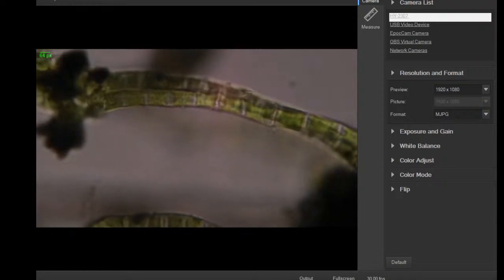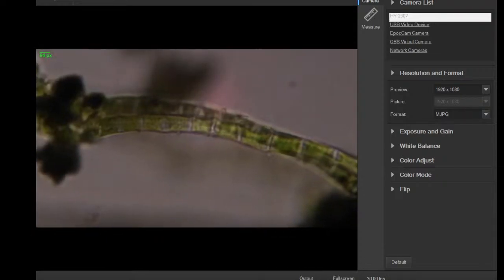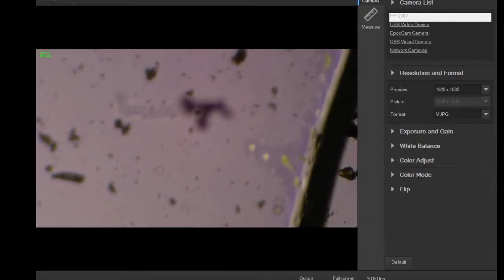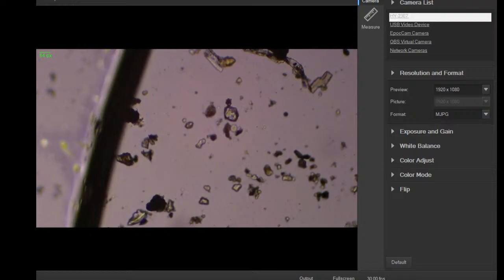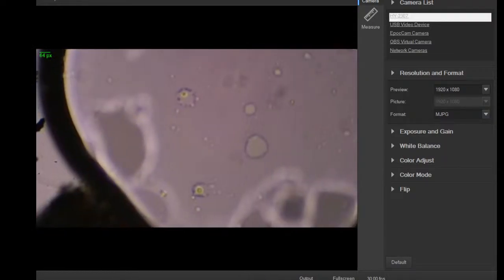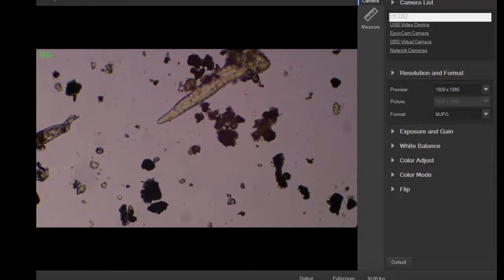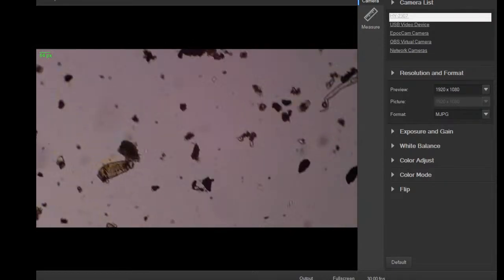Some little bacteria in there. Well, that's cool. Got some algae. Some little cool swimmers in there. So it was a good little sample. Anything else on the margins here? And a lot of dead plant material, some cool air bubbles that make little shapes. Little pieces of plant roots and other bits of plant material.